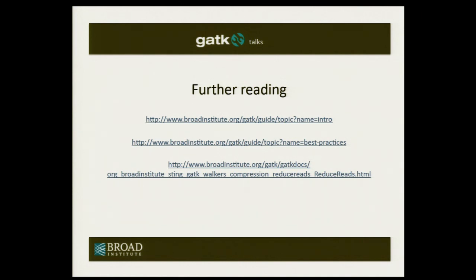So you do lose mate information inside the consensus regions, where typically it wouldn't matter because those are consensus regions and you don't care where the mate went. But you still have some information that usually is enough inside the variable regions for you to look for the start location of your mate, the direction of your mate. You have that information still preserved in the read that passed through in the variable region.